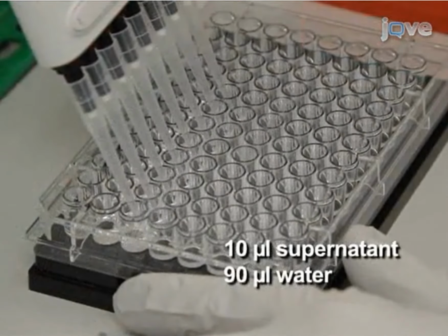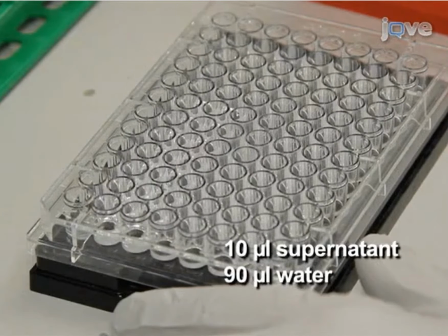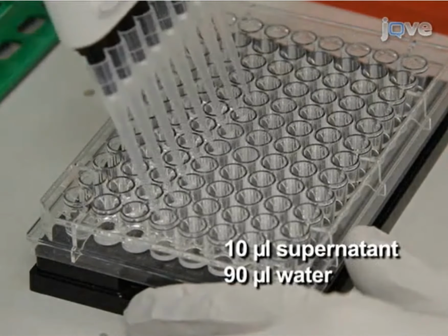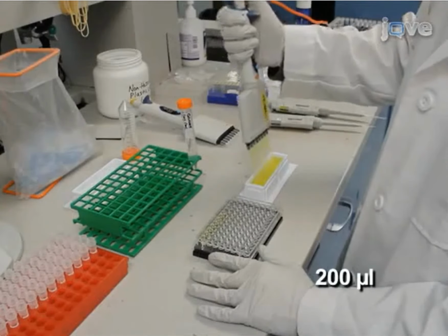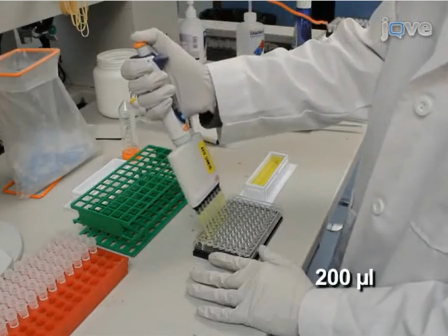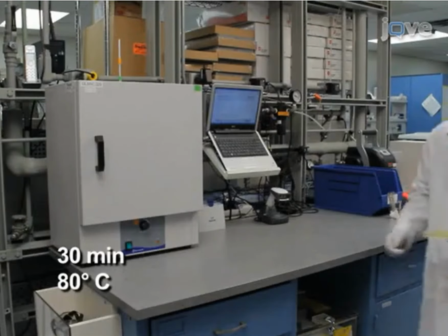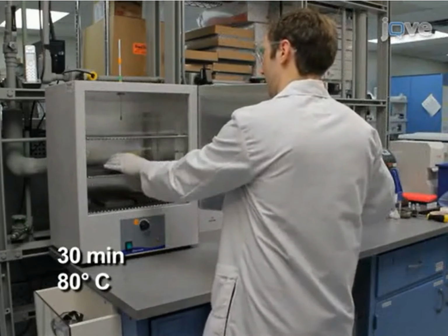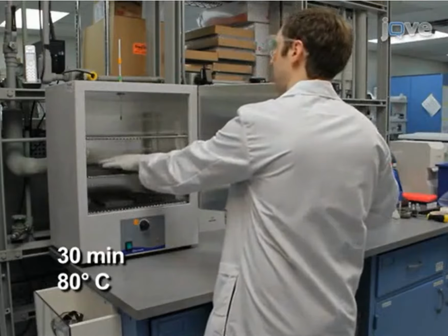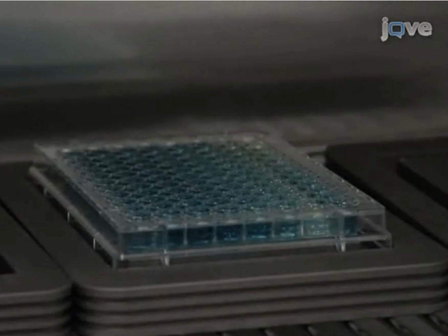Prepare the samples by combining 10 microliters of each sample supernatant and 90 microliters of water into separate wells of the same microtiter plate as the standard. Finish by adding 200 microliters of freshly prepared anthrone reagent. Next, heat the plate for 30 minutes at 80 degrees Celsius in an oven with an aluminum heat spreader. Observe that the glucose-containing samples turn from yellow to blue-green.